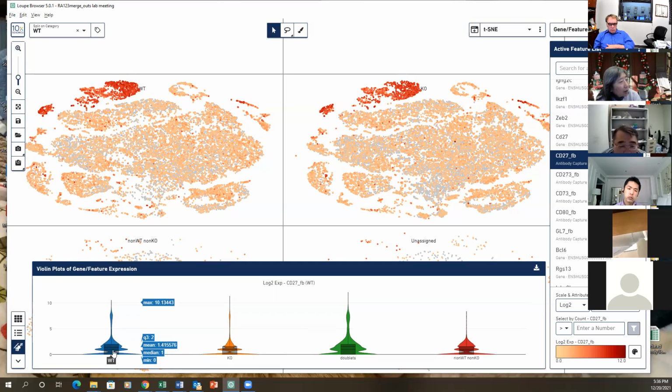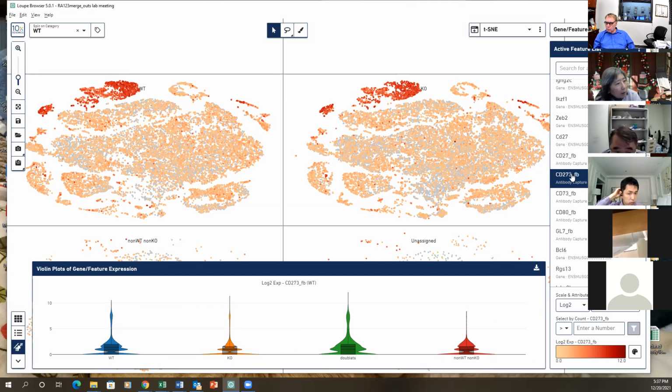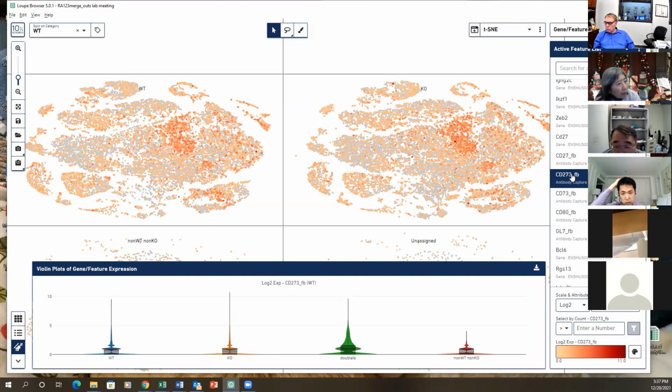So there's some difference here. Well, every group, the cell population, the wild type and the knockout, the cell number is different, and some had more for wild type, some had more for knockout. So the total number of cells, I didn't add up. But I compared each individual one. Each individual one, I have the list: how many wild type, how many knockout, and then compare how many memory for wild type and knockout, how many GC, FO, and then compare those numbers.